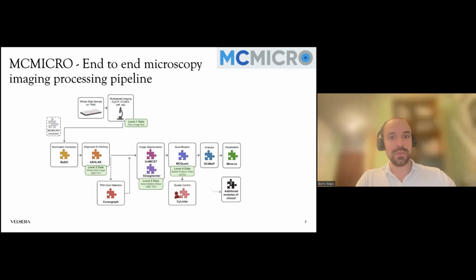Just to mention that this is happening right now, but the day after tomorrow, we will have another meeting with the developers of MCMICRO and the HTAN team to publish a newer version of this workflow. The version which is currently available is from a couple of months ago, and in the meantime, we have done a lot of additional work to make more features available in this Common Workflow Language version of MCMICRO.